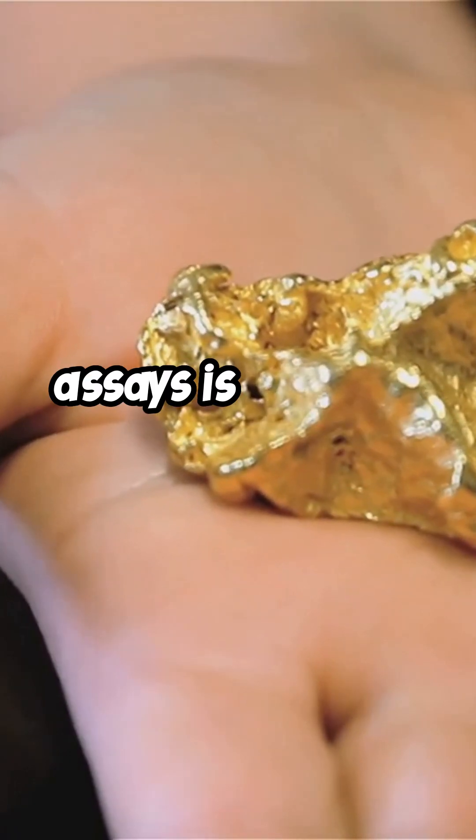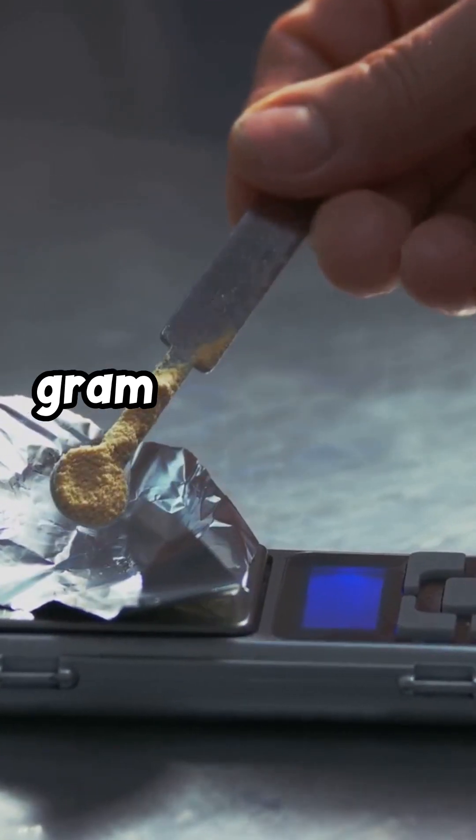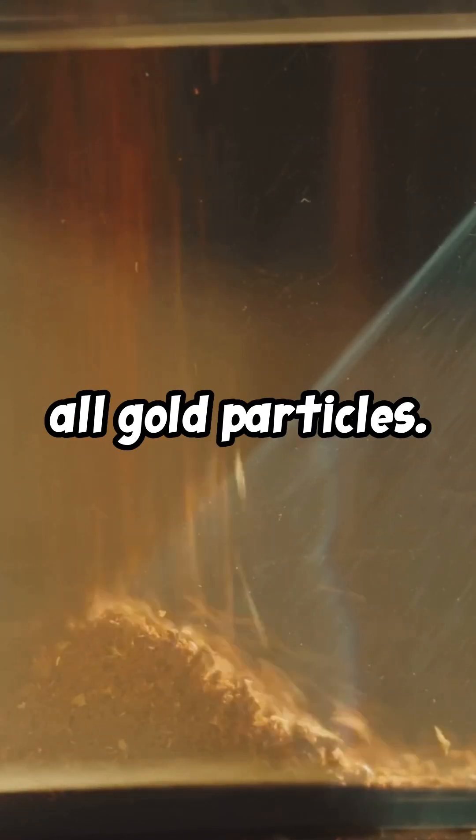If you're a miner, understanding gold assays is a game-changer. Let's dive in. First, we start with a 31.1 gram sample — 1 troy ounce. This sample is pulverized into a fine powder to expose all gold particles.